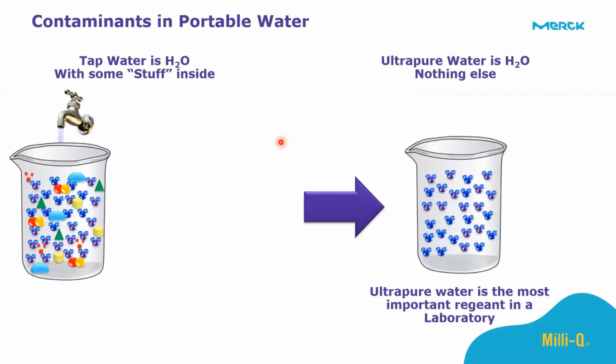So we have just said that the raw water or the tap water is usually the raw material for us to produce different types of water. Based on the location, of course, the natural water normally has 5 classes of contaminants, and these contaminants are normally removed to safety level for human consumption, and that's where we have the tap water, which is fit for human consumption.